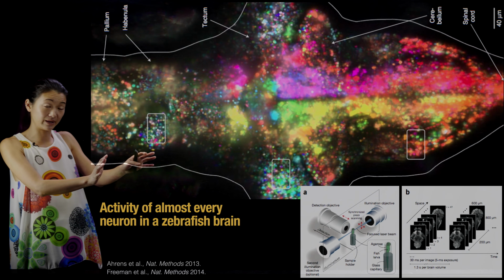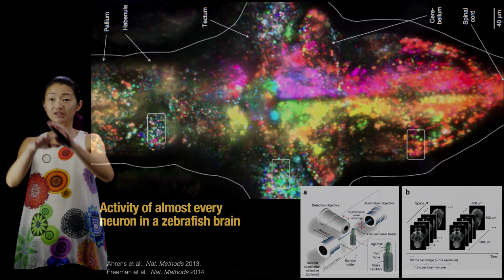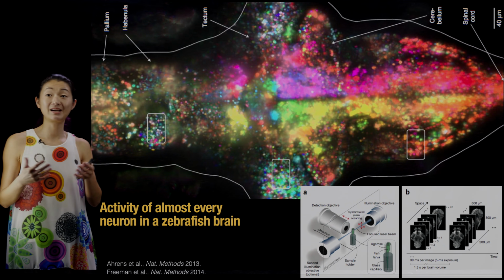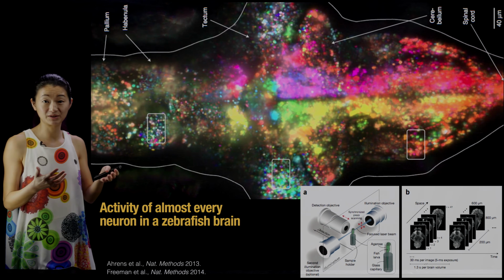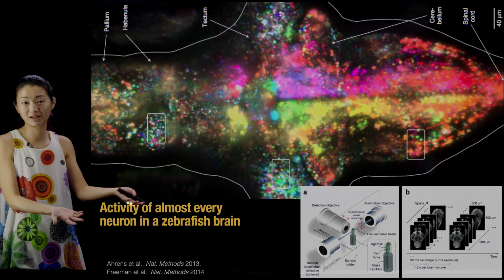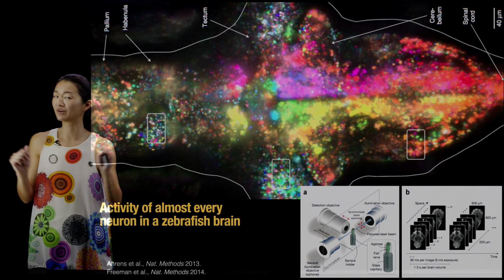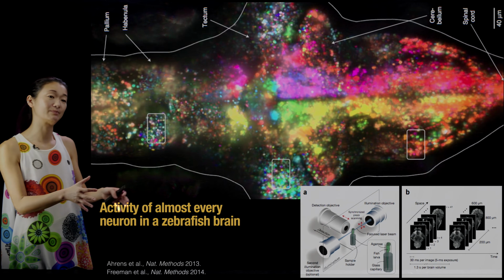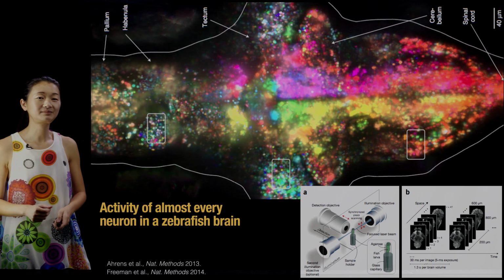This is closer to the picture that we were painting earlier about watching the movie as a whole, right? Now, this may not be the most exciting movie ever. This may not be what you want to do. We want to be able to do this in a human or a mouse or whatever, right? I mean, you might want to do that. I'm not sure I want to do that, but people want to do that, and it's a worthy thing to do. That's not quite possible yet, but it is possible in the zebrafish, and that's pretty cool.